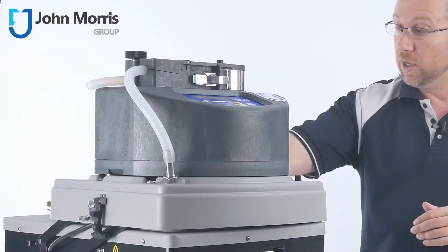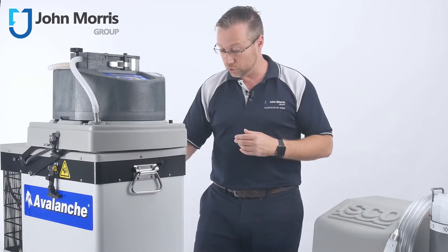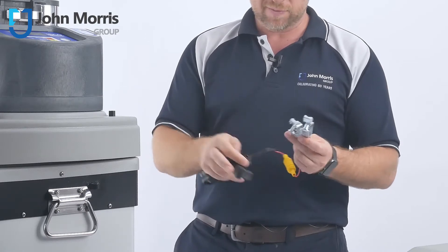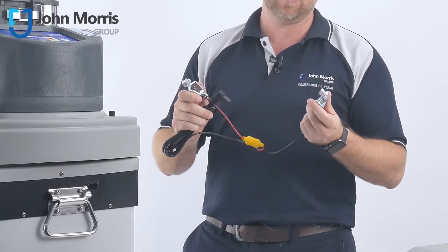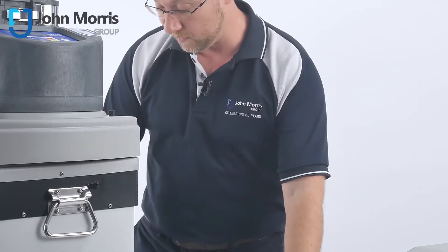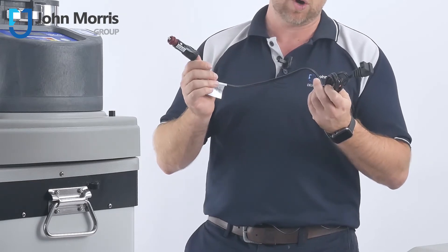Right out of the box, it comes with a number of handy little attachments. You've got an AC power cord so that you can plug it straight into your 240 volts, or in America you've got a 110 volt version. It also comes with these handy little alligator clips, which plug into the back of the unit and enable you to run it off a 12 volt battery. You will need a car battery or a deep cycle truck battery to run it because refrigeration takes quite a bit of energy. Or you can also plug it directly into the cigarette lighter of a vehicle and run it in the back of your truck.